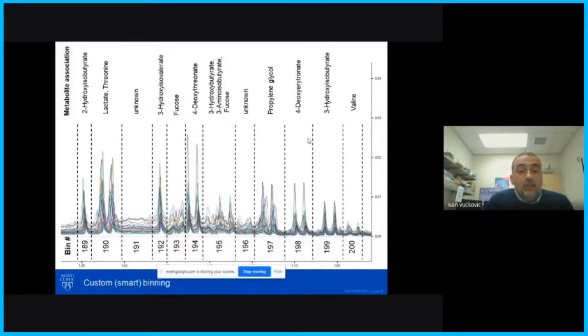You actually need to do it only once if you keep your sample preparation and sample acquisition methods constant, which we do. Then the peaks will be in the same regions all the time, and once you define them, you can use them over and over. Not only can you define these bins precisely, you can associate them with metabolites. So once you are done with your statistical analysis and you want to report your results to your colleagues from the biology or medical area, they don't see PPMs, which don't tell them anything. They can associate them with metabolites immediately.